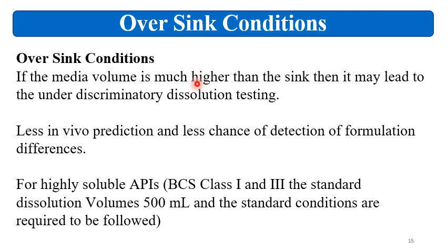conditions. Now what are the over sink conditions? If the media volume is much higher than the sink condition requirement, then it may lead to under-discriminatory dissolution testing. If you can perform the dissolution in 500 ml of the media and still you are taking around 1000 ml, then you can say that this is the over-sink condition. Then the over-sink condition may lead to less in vivo prediction and less chance of detection of formulation differences. You can also say this condition is an under-discriminatory condition.